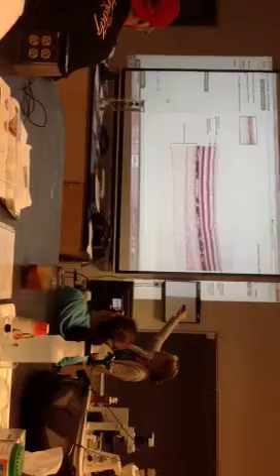The bipolar are going to be the middle layer of nuclei. And then the ganglion layer of nuclei can be pretty sparse. I've seen it look quite a bit more sparse than that, but that one's going to be the inside. And yes, the light comes in this way and passes past these other cells.